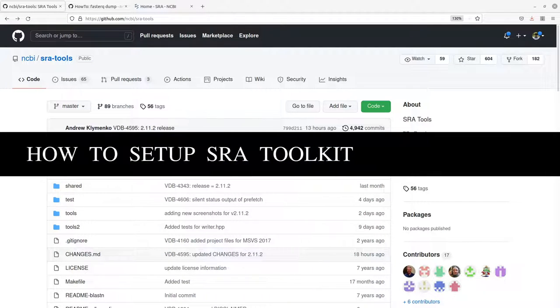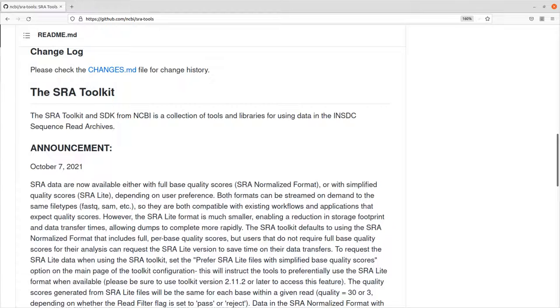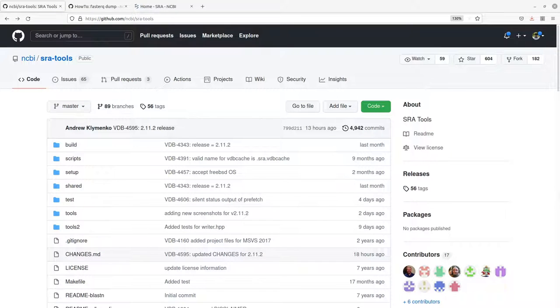Hi everyone, welcome to the Bioinformatics Code channel. In today's video I'm going to show you how you can install the SRA Toolkit. The SRA Toolkit comprises utilities and libraries that help you download, read, and access data from the SRA database — the Sequence Read Archive — which is an NCBI data repository.